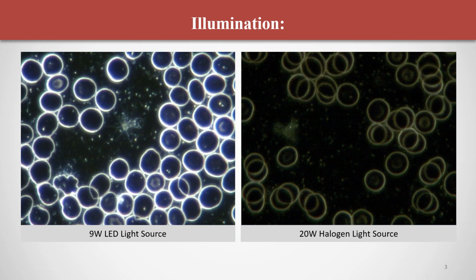White blood cell anomalies we look at in Darkfield. We look at the nucleus in the white blood cell. We also do a white blood cell count estimation by looking through the eyepieces. And because in Darkfield the granulocytes are highly reflective, they really stand out very clearly when looking through the eyepieces. So you're able to quickly count the number of granulocytes per viewing field. But on the system on the right-hand side, those granulocytes are not really going to be bright at all. So it really won't be possible to do a proper granulocyte estimation.